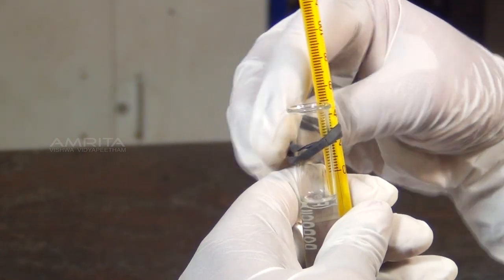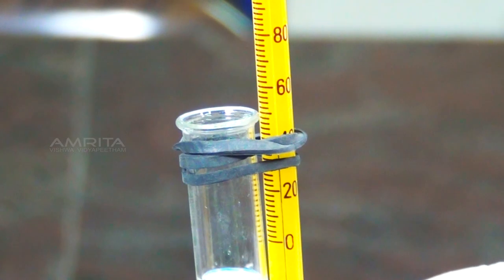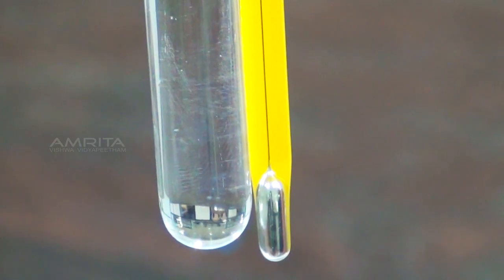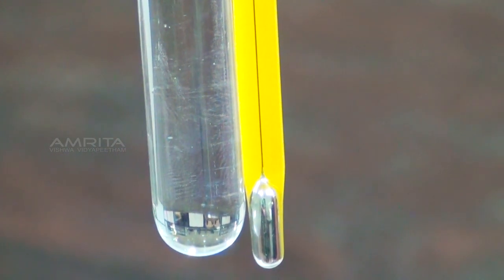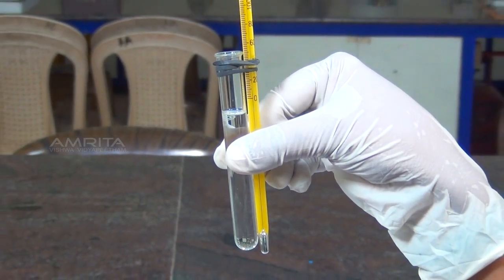Fix this test tube to the thermometer with the rubber band in such a way that the bottom of the tube is at the middle of the thermometer bulb. The rubber band should be fixed near the mouth of the tube.